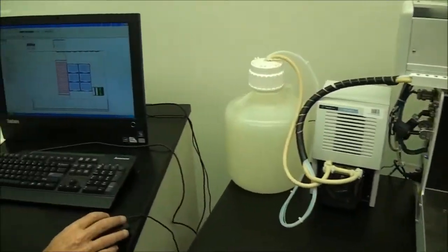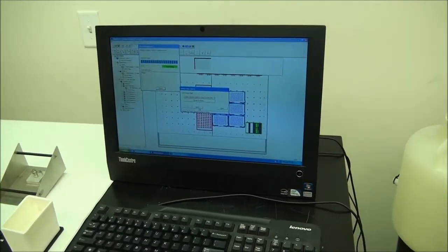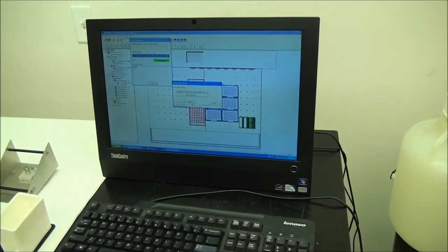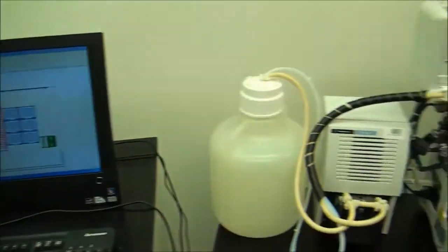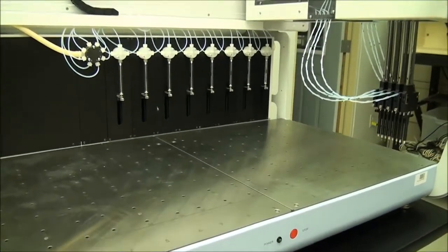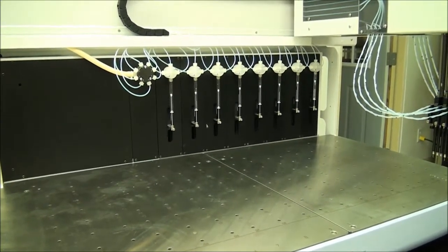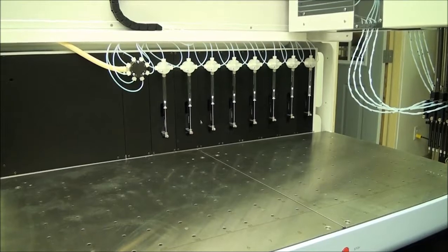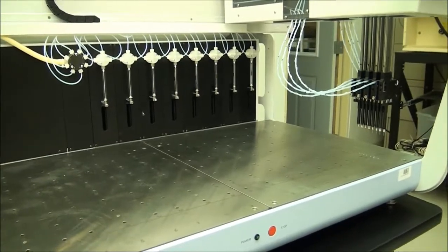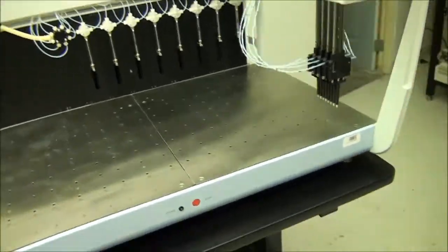We're gonna go ahead and fire this thing up and see what it'll do and give you a demonstration here. This is where you can tell it to verify where your labware is on your tray. We're gonna run it as a blank slate. You see the pumps initializing back here. Pump over here initializing. And move around here.